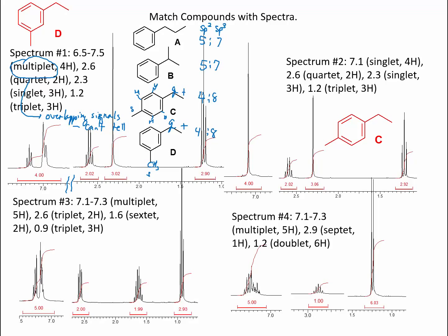In the other two, we have an N-propyl group here and an isopropyl group here. The thing to note here is that these hydrogens are equal, and we expect in V that our hydrogens at sp3 carbon, these 7 hydrogens, are going to be in a 6-to-1 ratio. And here we don't have this symmetry. We're expecting CH2 different from this CH2, different from this CH3.